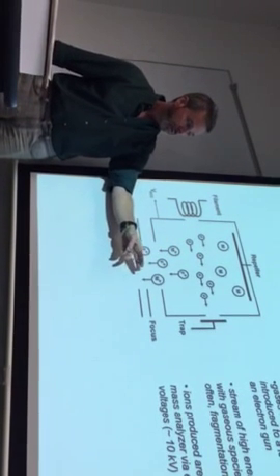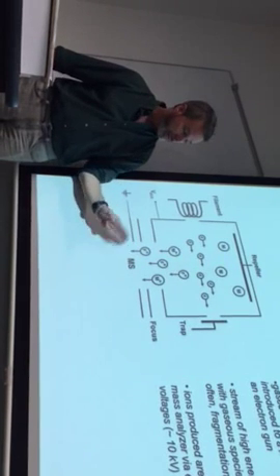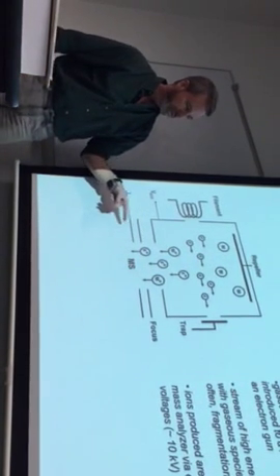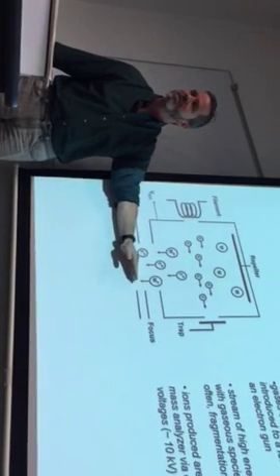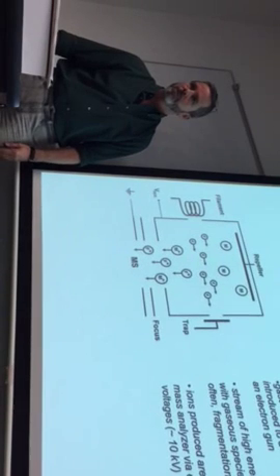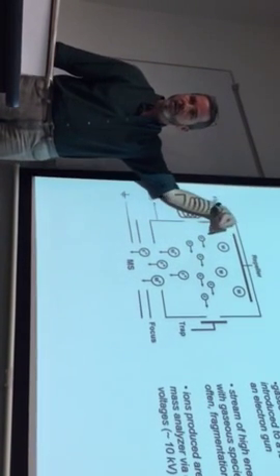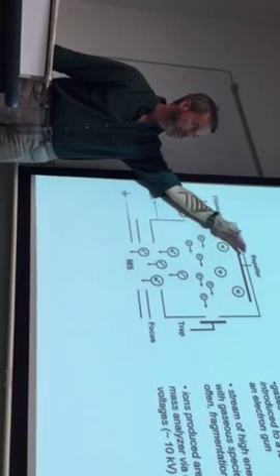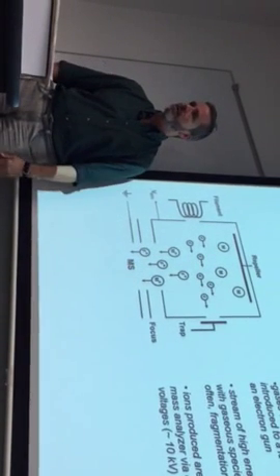Most of them will probably strike the walls and be annihilated, but some of them will exit through a little slit in the focusing, and also accelerating, electrodes. So the cations that are produced are accelerated out of the source by this large potential field generated between the repeller and the focusing and accelerating electrodes.